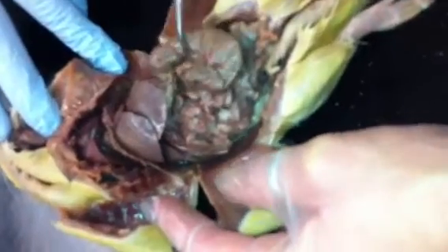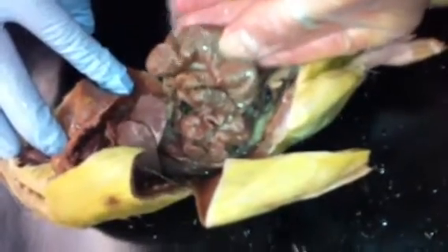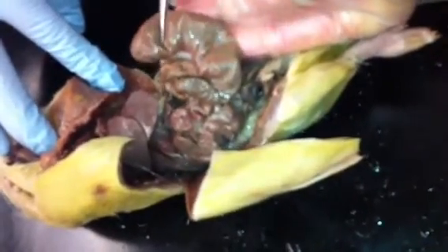And then these are all intestines, so this is mostly small intestine, but then I don't know if you can tell the difference. See, this obviously looks really big. So this is a portion of the large intestine. Now this is first part. It looks like a big pouch or a sac. It's called the cecum. And so it's pretty identifiable compared to the other intestines.